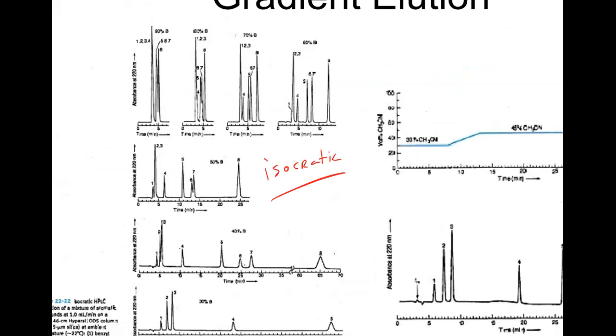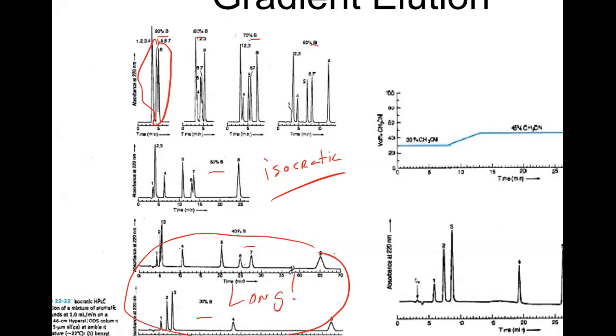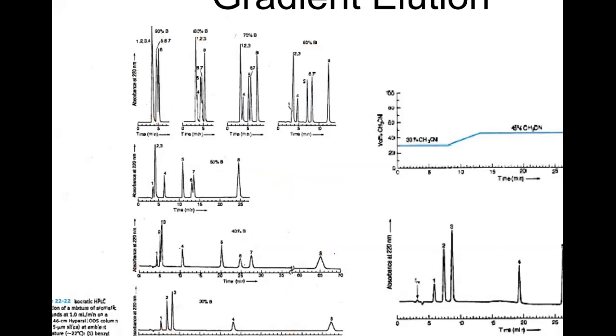When they ran this experiment, they always kept the mobile phase the same: 90% acetonitrile, 80, 70, 60, 50, down the line. And what they found was if they went too high a percentage of acetonitrile, everything eluted really fast. The experiment was over, but it all came out in a big blob. Nothing was resolved. So they were forced to decrease the concentration of acetonitrile. But when they did, things took so long to elute, 60, 70, 80 minutes, and we may not even get great peaks for substances 6 through 8. So we can't win, right? If we go too high a B, everything comes out as a blob quickly. Too low a B, we can't even see the late eluting peaks.